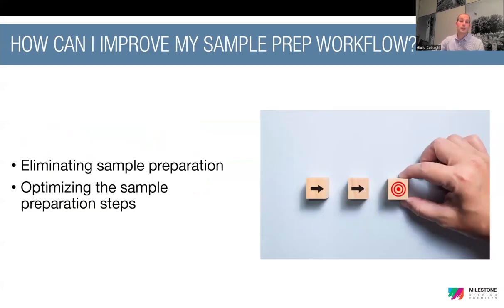When we consider the sample preparation workflow, or better, when we consider the path from sample to analysis, ideally, we want to reduce as much as possible all the steps. So eliminating the sample preparation is the ideal scenario.